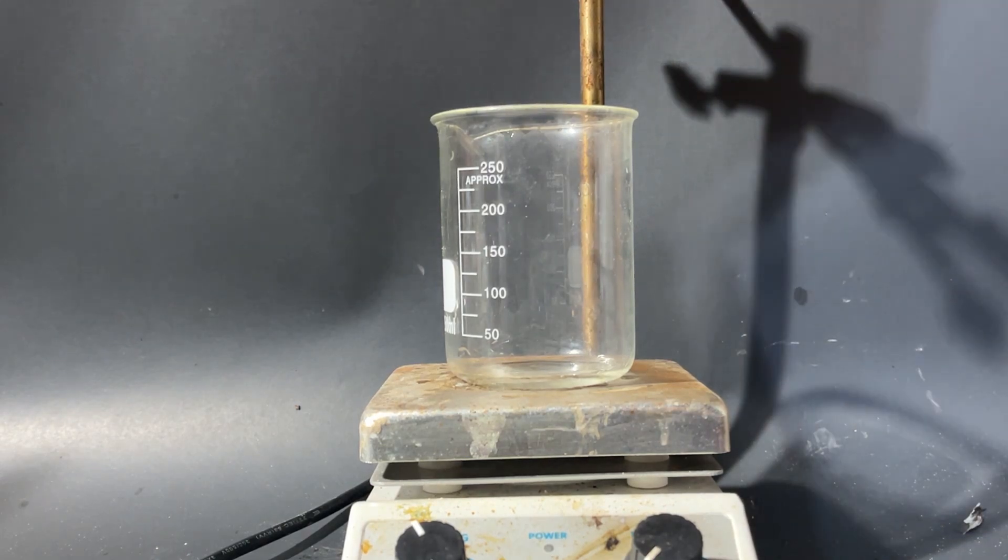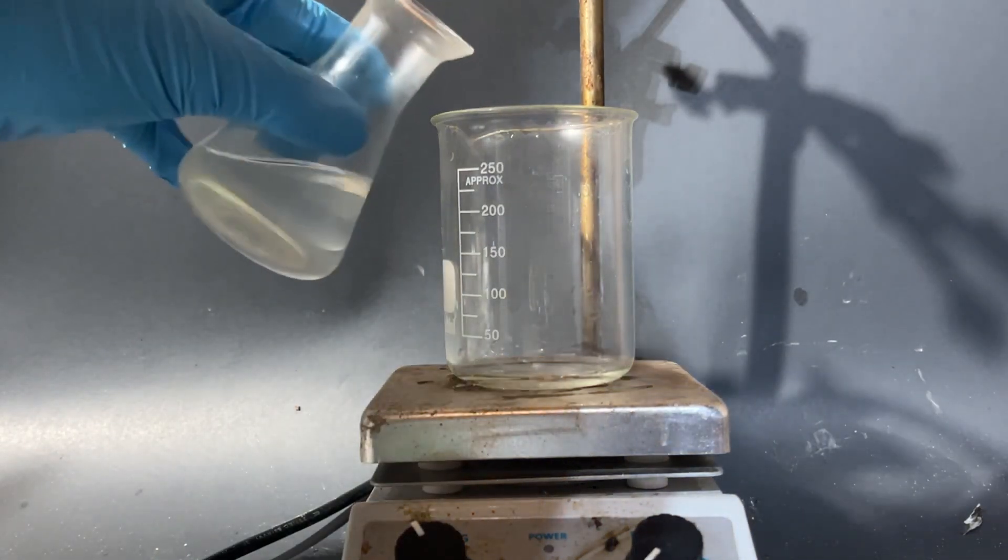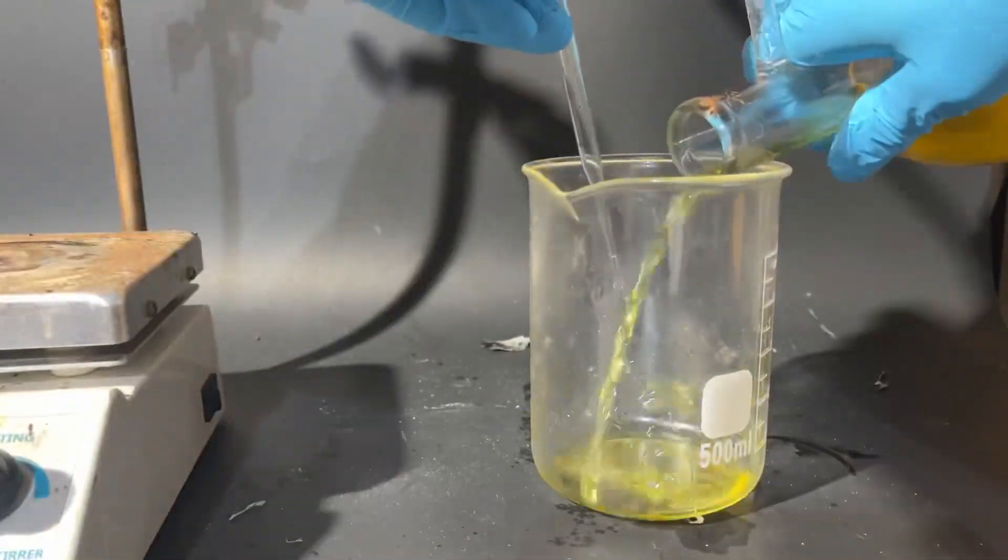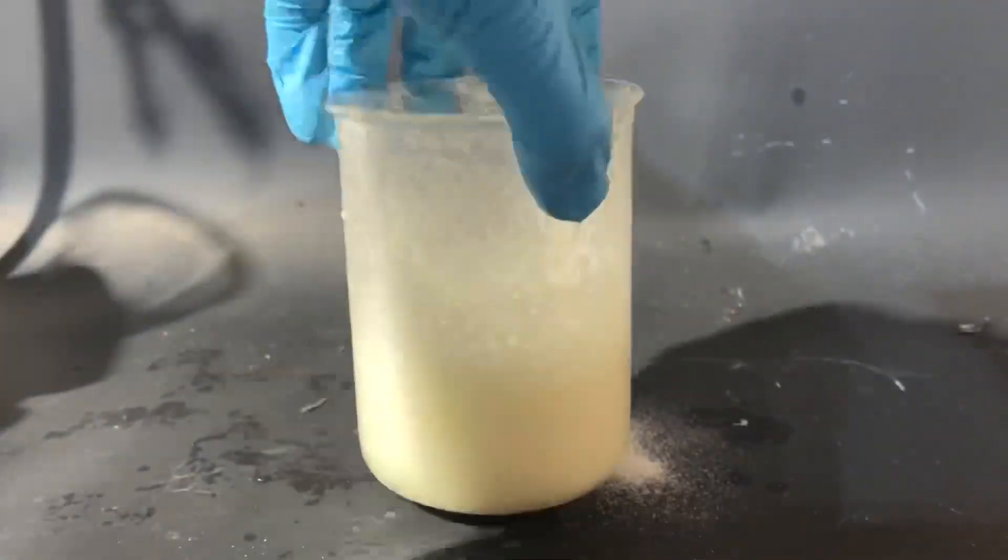After about 2 hours of this, I transfer the solution of hopefully ammonium chloride into a beaker, and I set it up on my hot plate for a recrystallization. While this happens, I transfer the hydrochloric acid from my flask to a beaker, and I edge it with sodium bicarbonate.